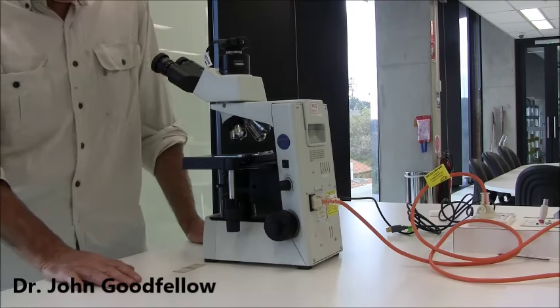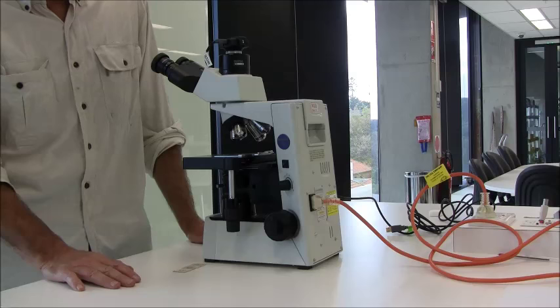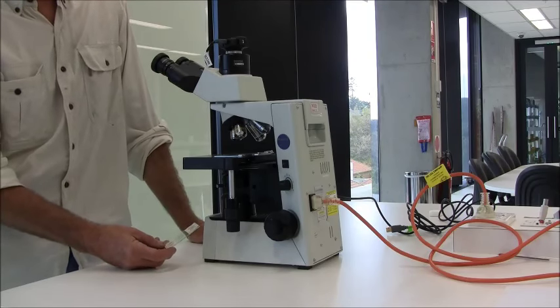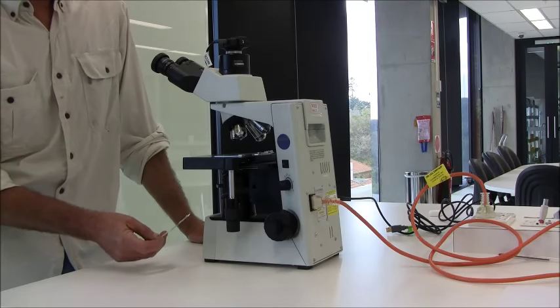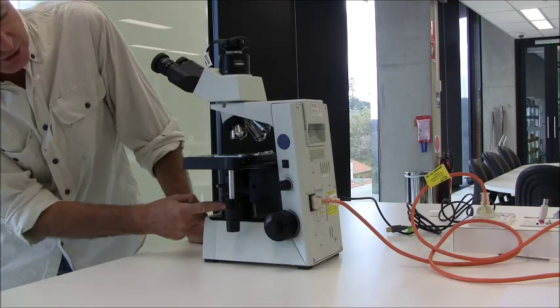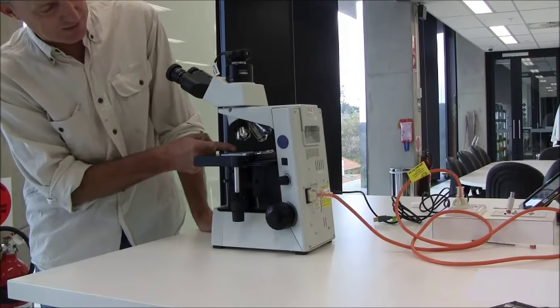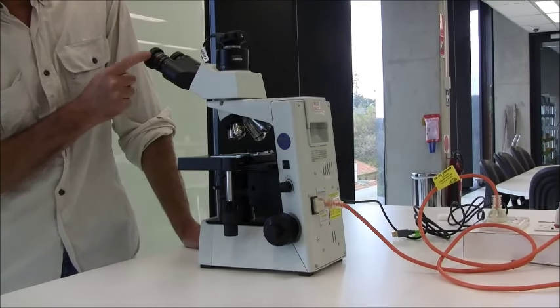The compound microscope is a little bit more complex than the dissecting microscope. It has a few more dials and needs a little more careful treatment. It's used for looking at specimens that are generally microscopic to the naked eye and very thin so that light can pass through them. Light from a light source is passed through a series of lenses that focuses the light on a specimen clamped on a stage. The image is then passed through the objective lens and up through the eyepiece lens and into your eye.